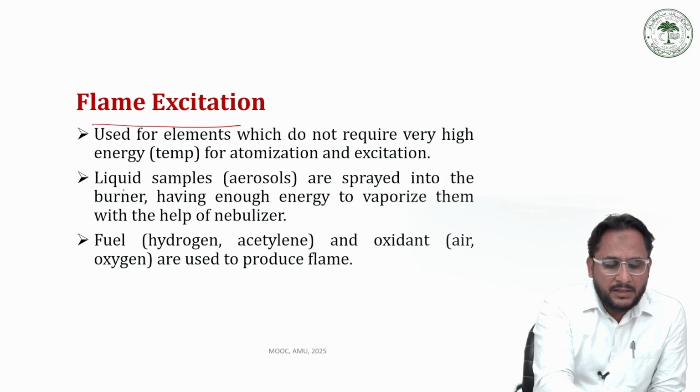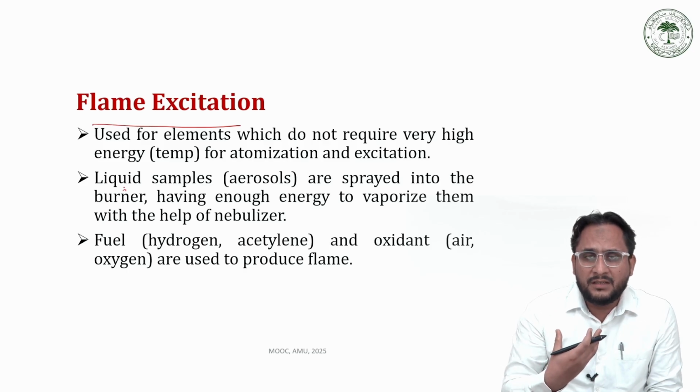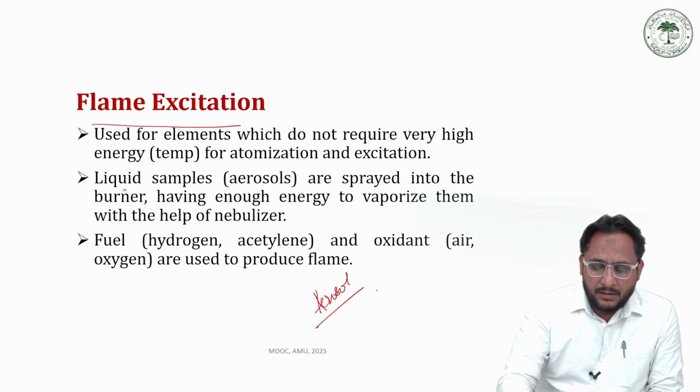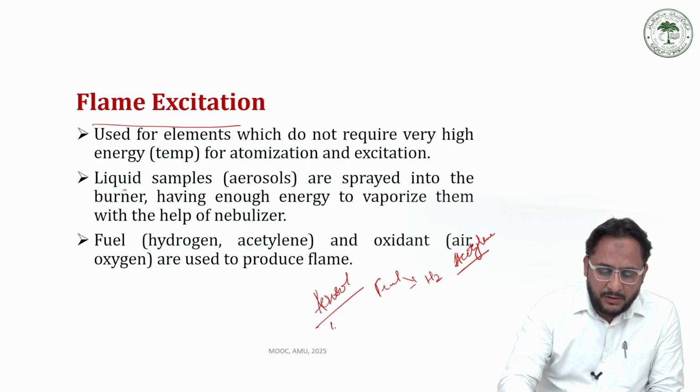So in this technique, because the sample is coming from the nebulizer in the form of an aerosol, now we need fuel. We have options available, like hydrogen. We can also use acetylene, like in AAS where acetylene is very common. Further, we also need an oxidant.